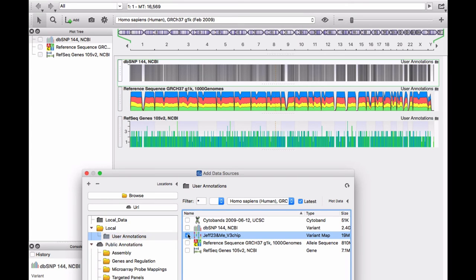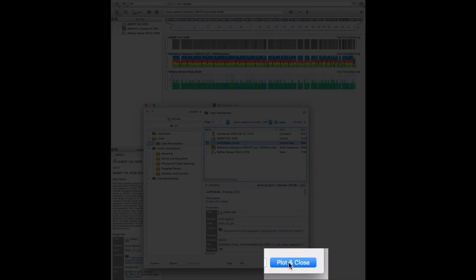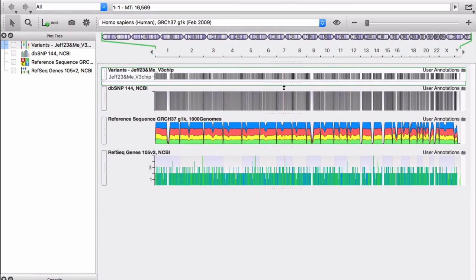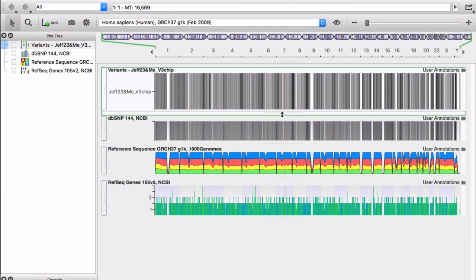Select the file that contains the converted data. Now click on Plot and Close. A new track appears in Genome Browse.